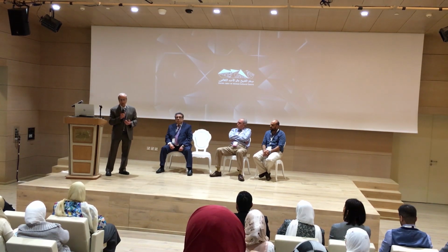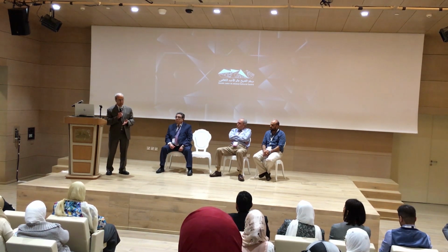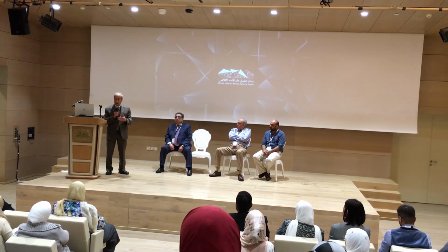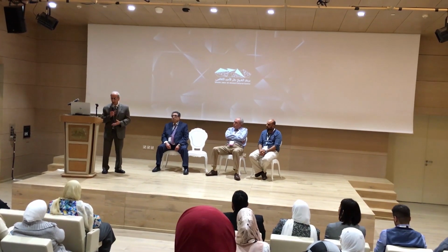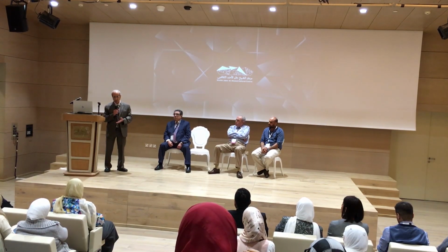So part of the inspection is to interview a representative from the medical staff, usually the CMO, the Chief Medical Officer, and a representative of management, the Chief Executive Officer. So we do that either at the beginning or during the inspection, depending on their time. That's usually a very brief interview just to familiarize ourselves with the process.